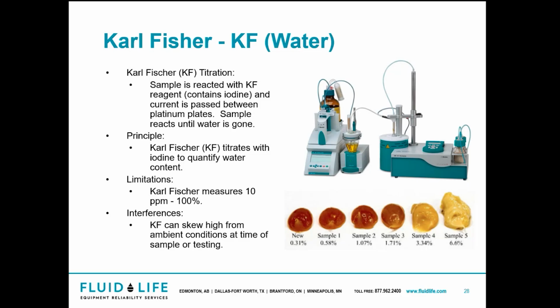So let's go back a step here when I was talking about water being in grease. How many of you have seen grease that looks like it is on the right? The one on the left looks like nice, good grease, but you see that really swollen grease, right? So it swells. Grease swells big time when it gets wet, and that's where we see that high percentage of water in our grease like that.